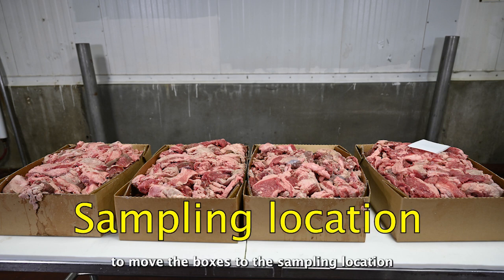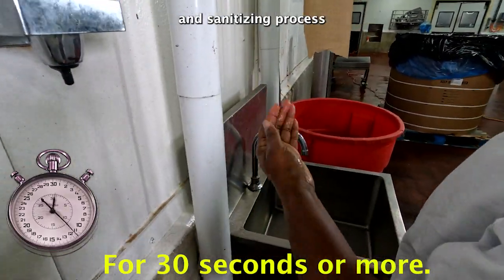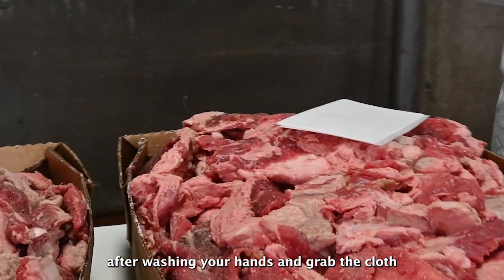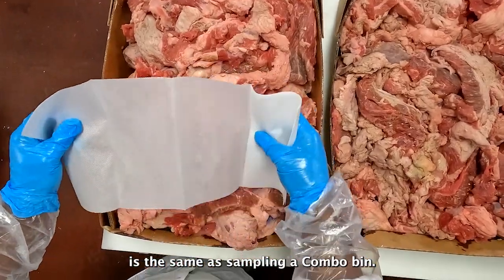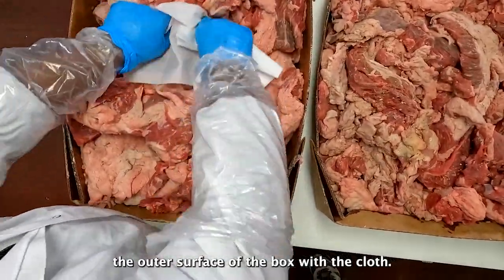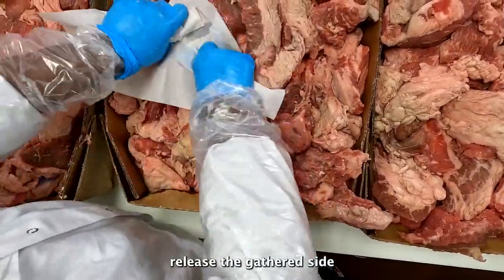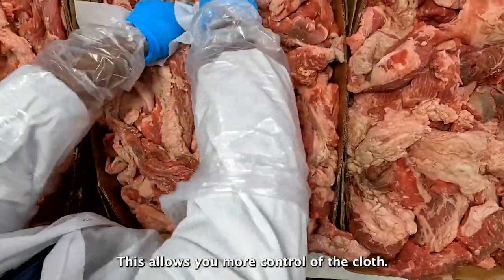Next, you'll ask the establishment to move the boxes to the sampling location and prepare them to be sampled. Then follow the hand washing, gloving, and sanitizing process as described earlier for combo bin sampling. Drop the cloth into one box after washing your hands and grab the cloth only after gloving to begin sampling. As a tip, you'll need to avoid touching the outer surface of the box with the cloth. To do this, tightly gather the side of the cloth you are not sampling with in one hand, and when moving to the next box, release the gathered side and tightly gather the side that was previously used. This allows you more control of the cloth.